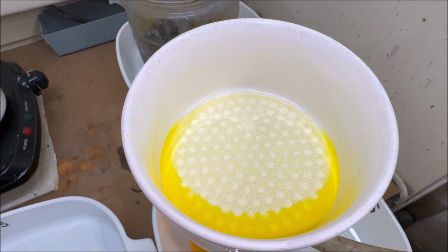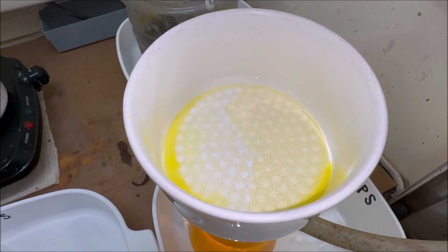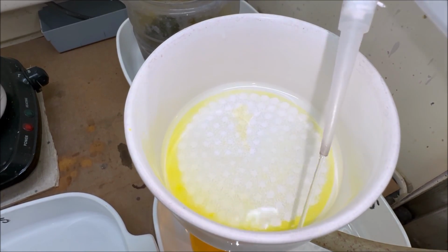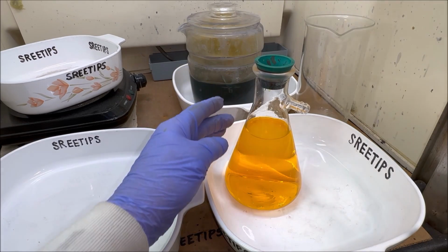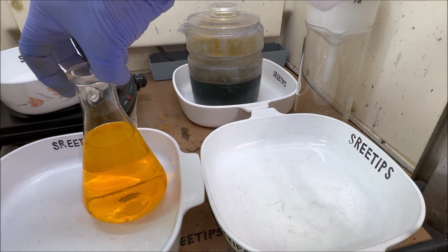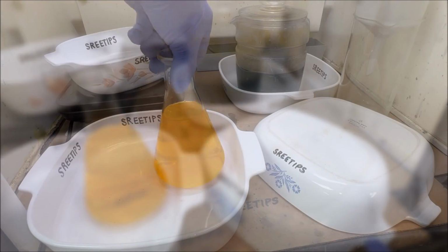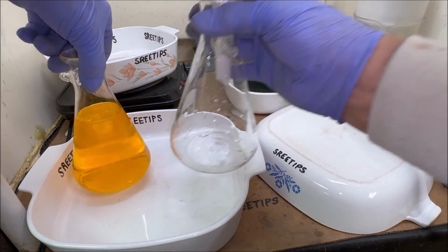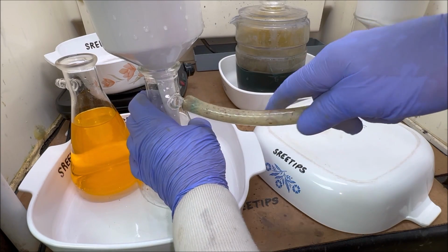Alright, here's what's left in the filter. I believe that is going to be lead sulfate. Still got some stuff in there. It's cloudy, so we're going to run it through a filter one more time before we do the precipitation.